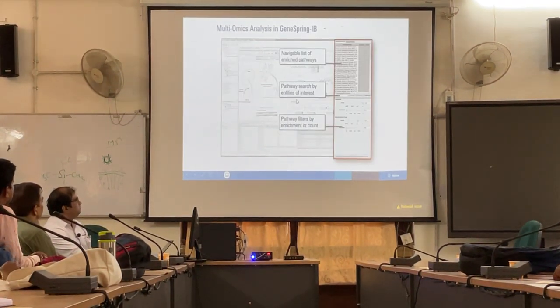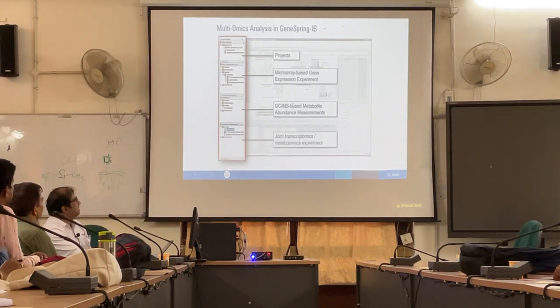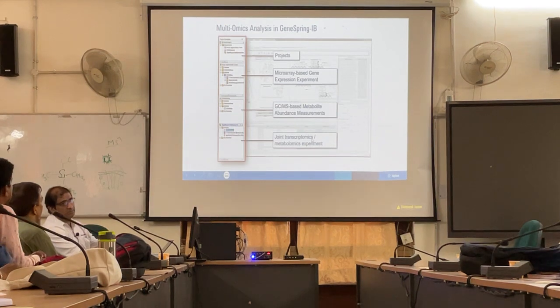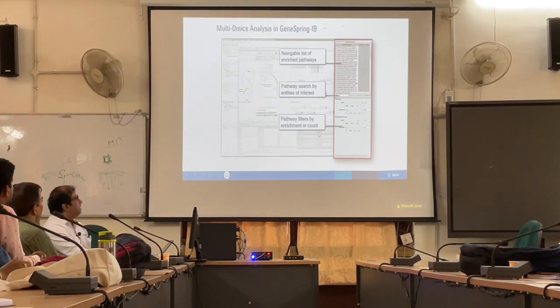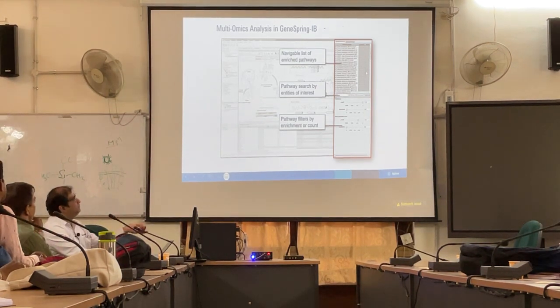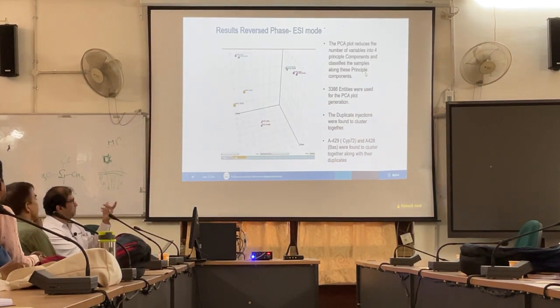You can use gene based data. You can use GCMS based data. You can use NMR data also in this. If you have any Excel based data, you can use it. And what you will do is a pathway centric approach. So I'll show you some examples for plant metabolites. Then it will establish how you will be able to interpret this.